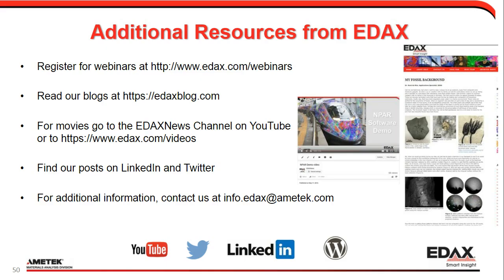The first question is: is it always better to collect maps using net instead of ROI? The answer is yes. Net mapping is always better than ROI. Net mapping does background subtraction and peak deconvolution, but it requires more calculation, so some of the systems do not feature live net mapping.